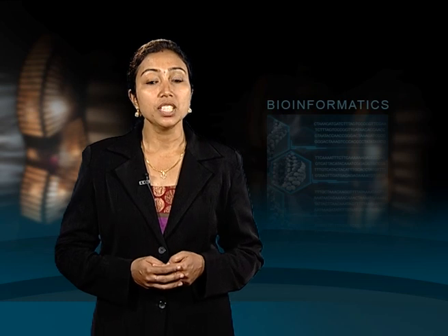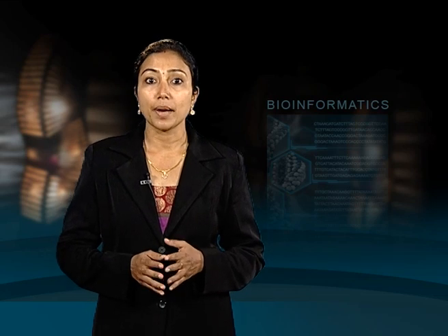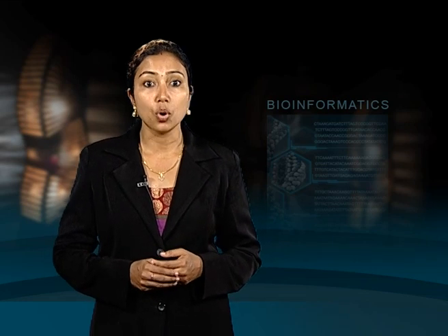Change in the number of these repeats gives the length polymorphism, which is revealed by designing primers for the sequence flanking the microsatellite repeat motif, followed by PCR amplification and visualization in agarose or denaturing polyacrylamide gel.